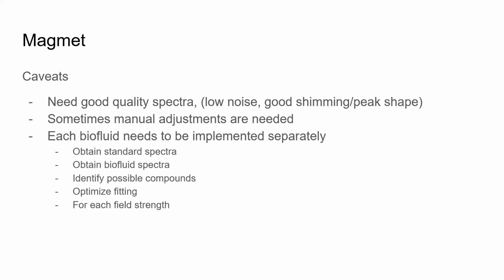So we find that Magmet seems to work fairly well with serum and fecal so far. However, we do need fairly good quality spectra, so low noise, and the shape of the peaks has to be symmetrical, so the shimming has to be good. And sometimes we need to look through the spectrum and manual adjustments are needed.